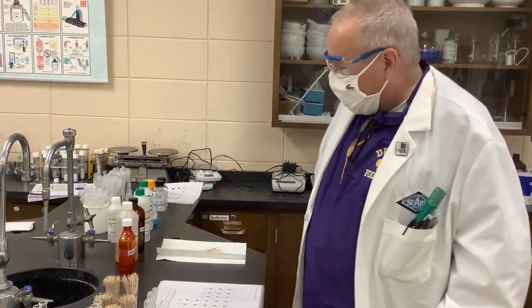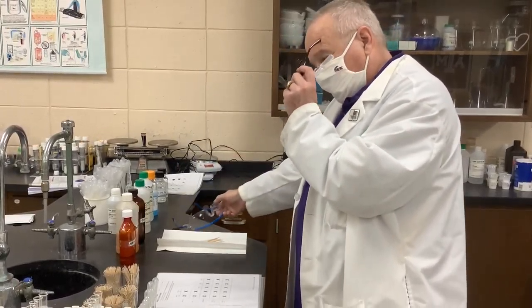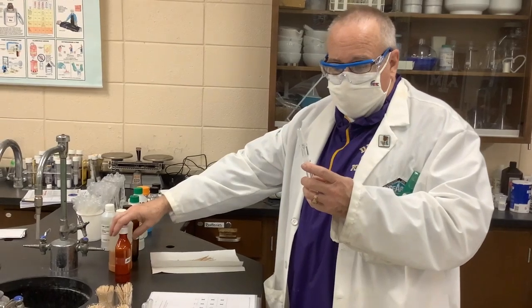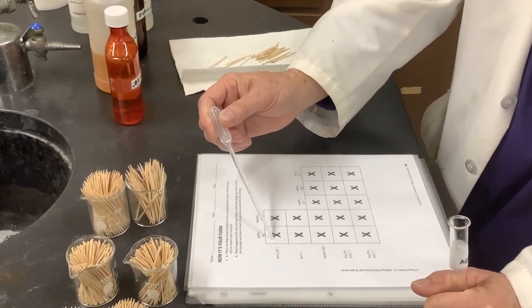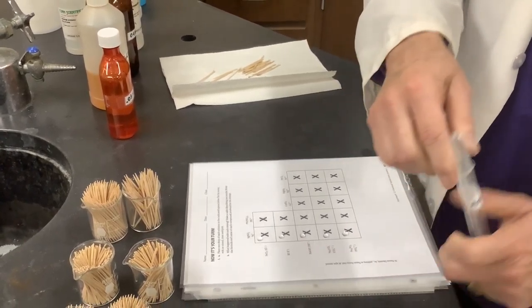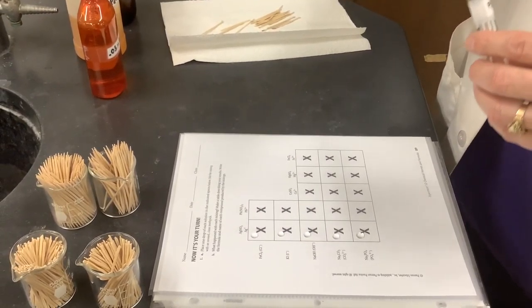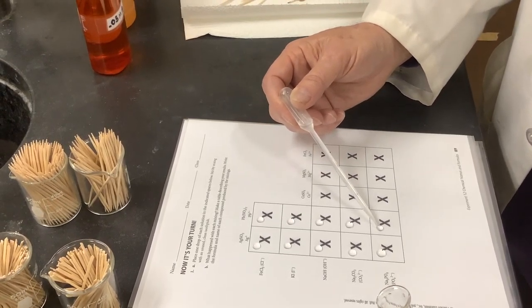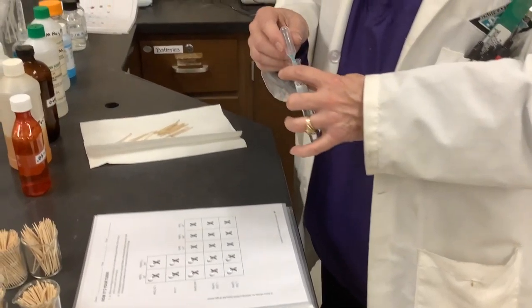I'm going to wear my safety glasses and be careful not to get any of these solutions on me. We're working with some toxic solutions like lead, strong bases like sodium hydroxide, and potentially toxic materials like silver nitrate — although when I was first born they put silver nitrate in my eye. It's always stored in a brown bottle because it is light sensitive. I'm going to put a drop of silver nitrate in each of these squares in this row.